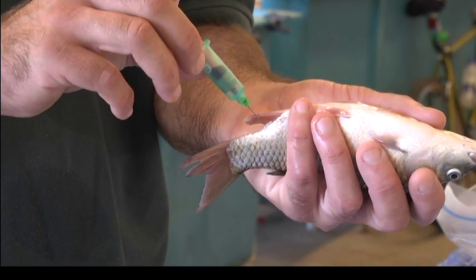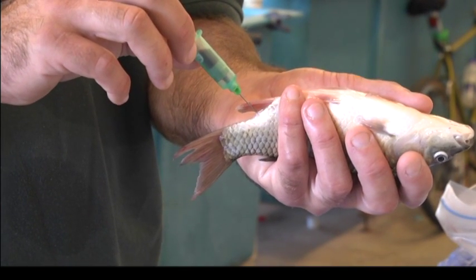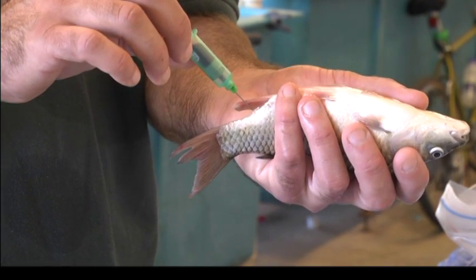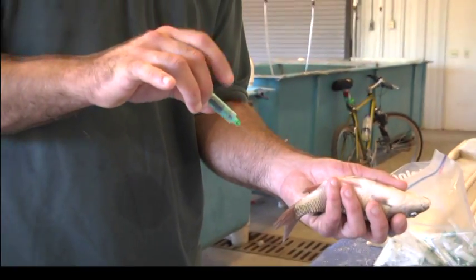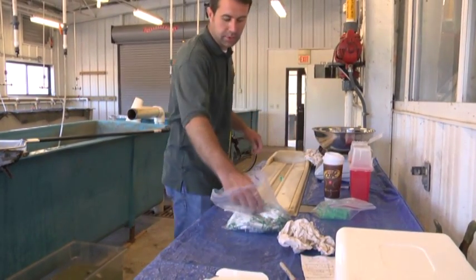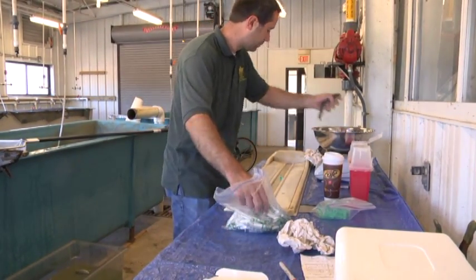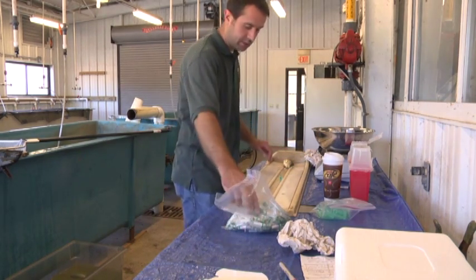There it is. You want to make those real minor adjustments and move the needle slowly. You don't want to pull the needle back out because if you do, you lose the vacuum. 163 grams, 20.7 centimeters.